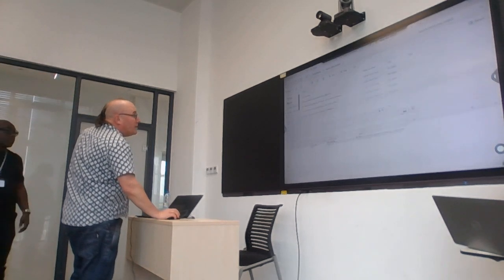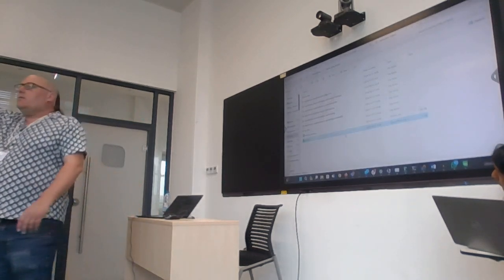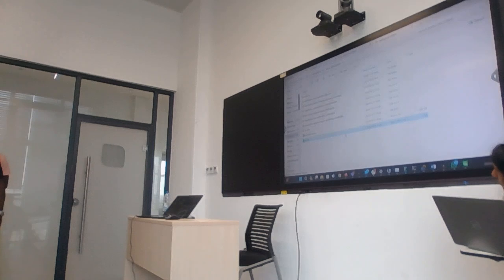Now for the next thing, who here knows what Nextclade is? Nextclade? If you've worked with COVID-19, SARS-CoV-2, you might have used Nextclade. Okay? Nextclade is from the same group that makes Nextstrain. Nextclade. Okay? It's a website.